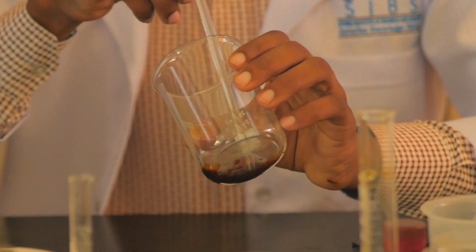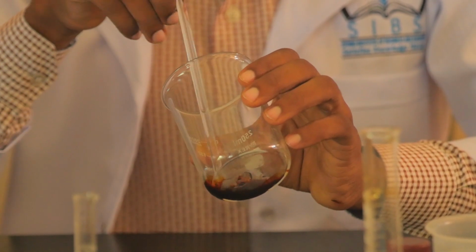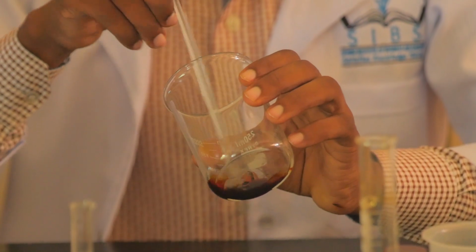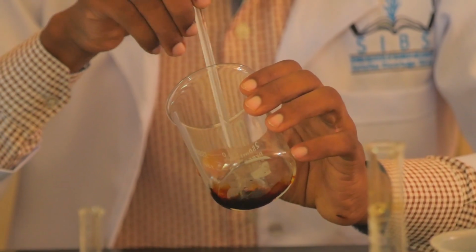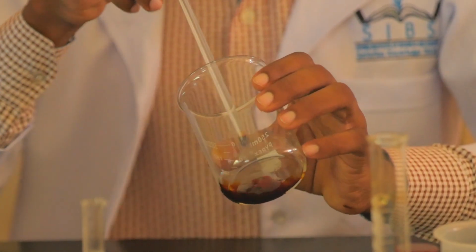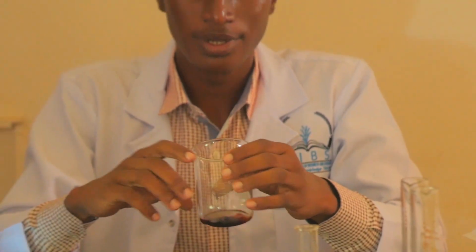You stir until each particle dissolves fully in this solution. This is completely done. Now this is our weak iodine solution, but this is not 20 mils.